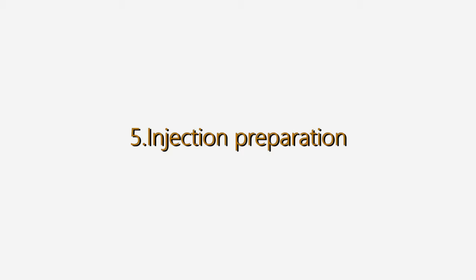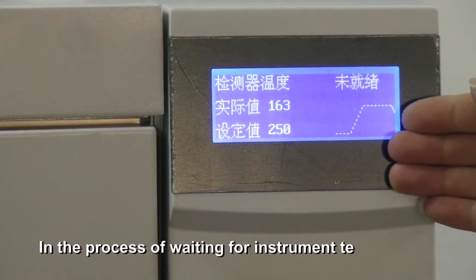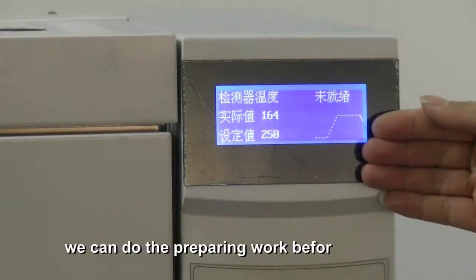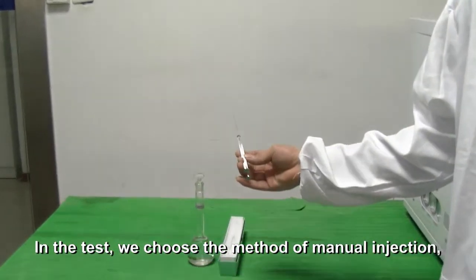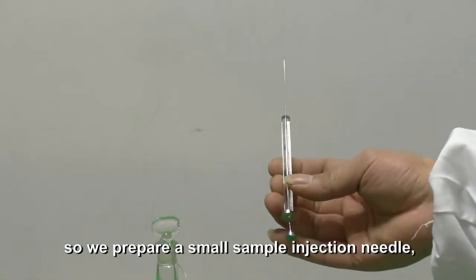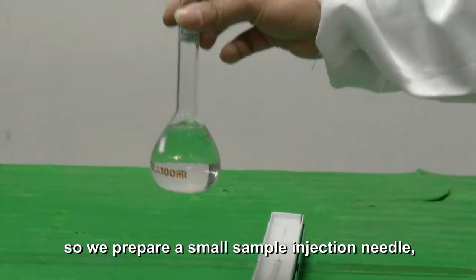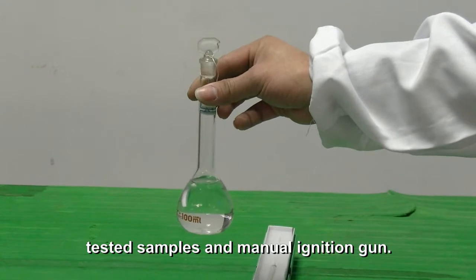Injection preparation. While waiting for instrument temperature, we can do the preparation work before injection. In the test, we choose manual injection, so we prepare a small sample injection needle, tested samples, and manual ignition gun.